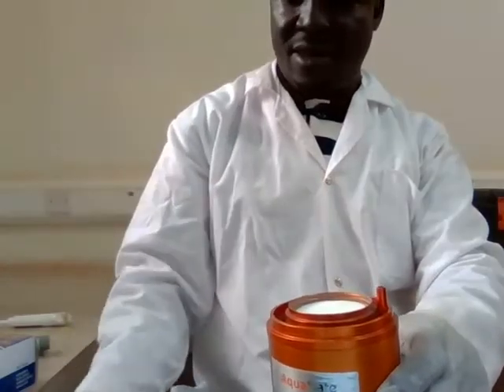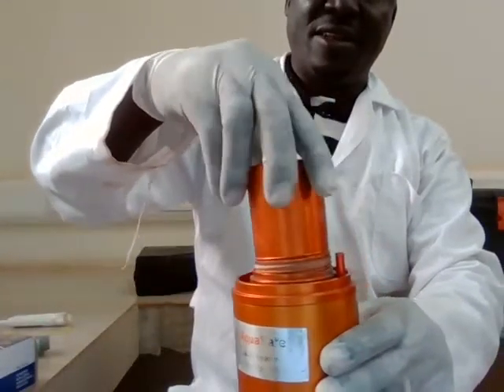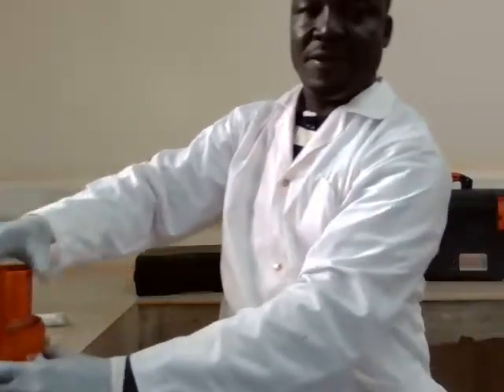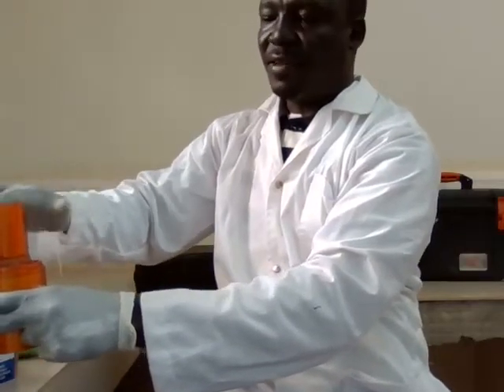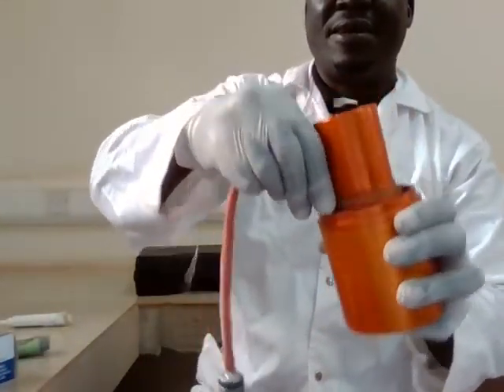Okay. Then you bring your cup and remember to be doing this on the bench surface, where you don't risk a fall, and you connect this pump here.